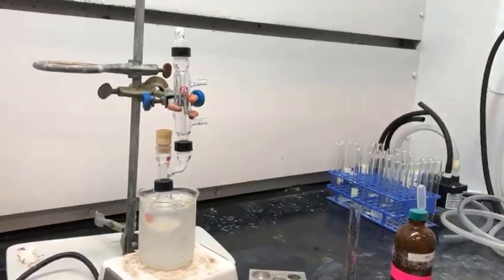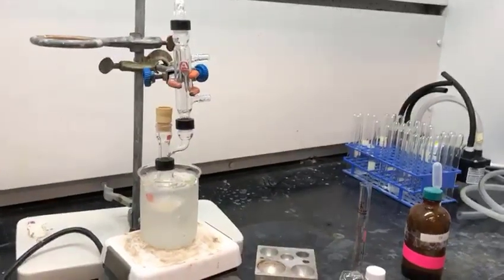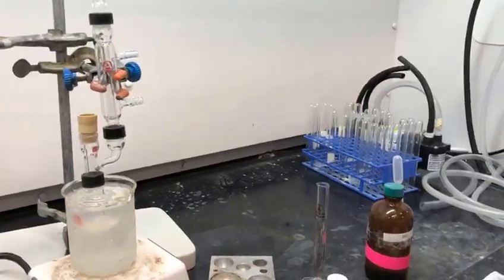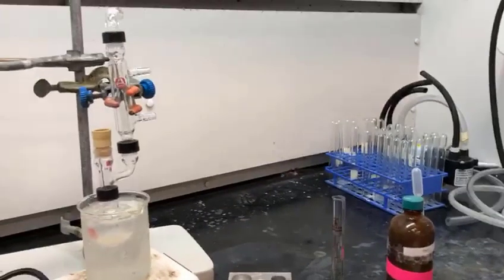All of this has to be done in ice cold temperatures, so our stir plate is a stir plate/hot plate combo, but the heat is off. We are just stirring, and the round bottom flask has been submerged into an ice water bath.